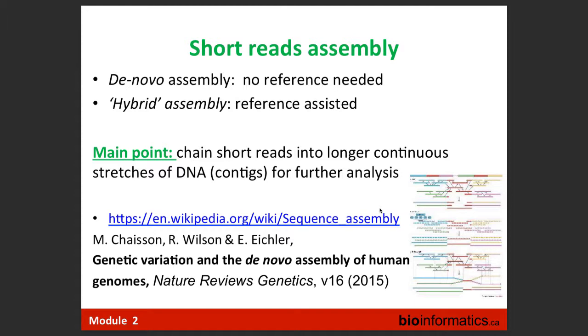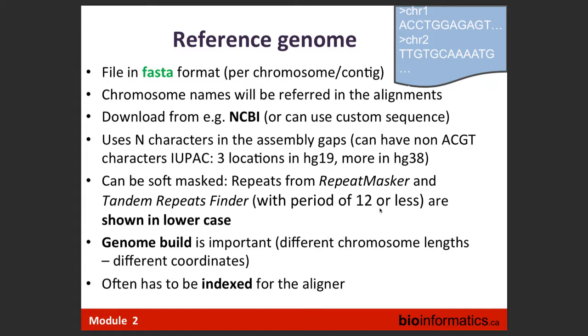There is also another thing we can do with short sequence reads, and some people do. We're not going to talk much, almost at all, in this workshop, but there is also short read assembly. People try it even for ChIP-seq data: assembling short reads. This is basically stitching reads into continuous longer DNA stretches, contigs, and then aligning those to a reference genome, or just analyzing those. There is a review, which is here. You can look at it and think about the applicability of this approach.